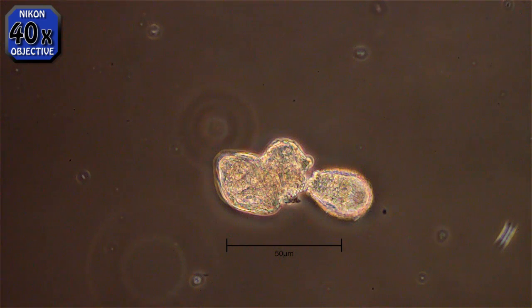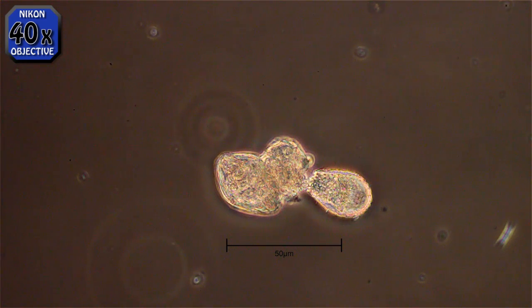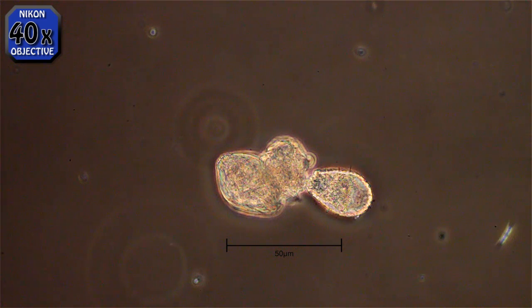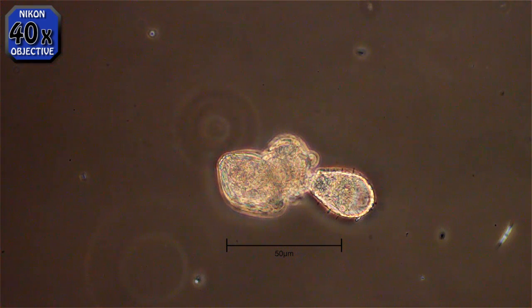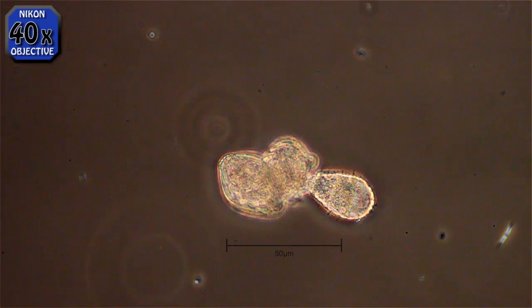He's attached to something on the left there. I don't know quite what it is — I never did quite figure it out. It's obviously something dead, and he's scavenging like a vulture.